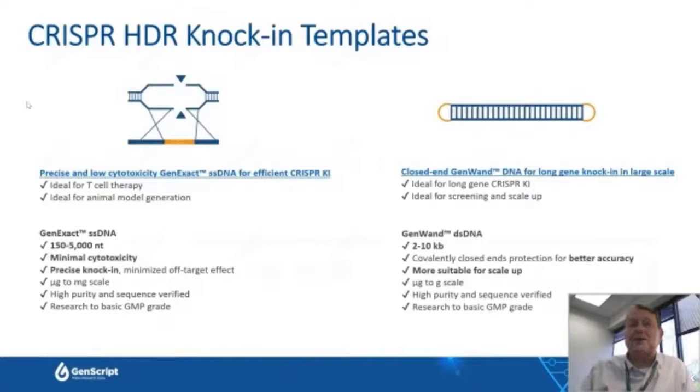And if you enhance your transfection and you're able to use single-strand DNA like we're trying, it skews the capsids for those having only the positive strand message, which makes the dose much more effective. And you get less negative strand, which you can't use in your capsid. And it also reduces the amount of empty caps.